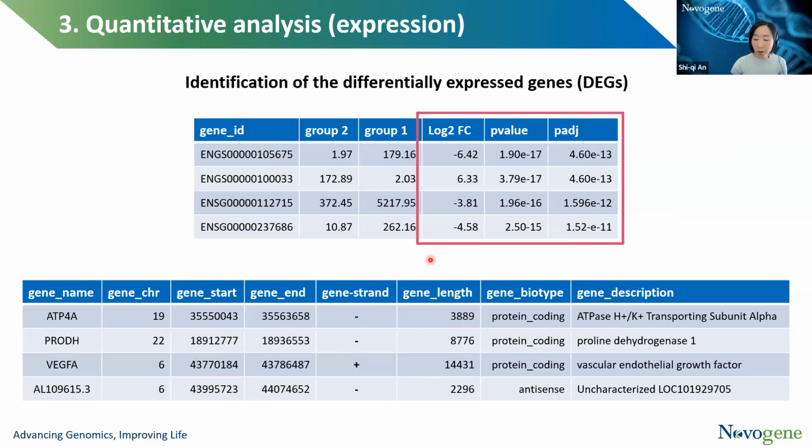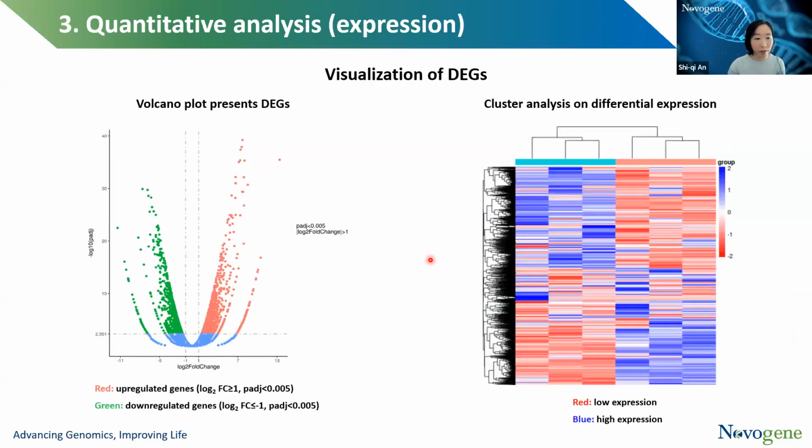Okay, so after this step, you're going to have a gene list that contains the genes that are differentially expressed in the different conditions you tested. So how are we going to visualize this data? There are a couple of different ways here.